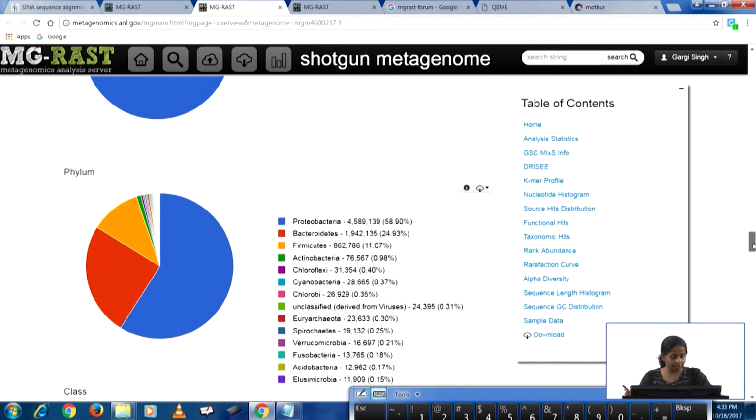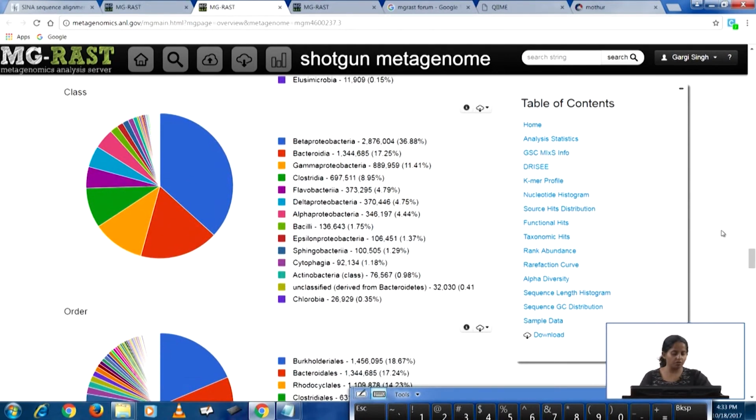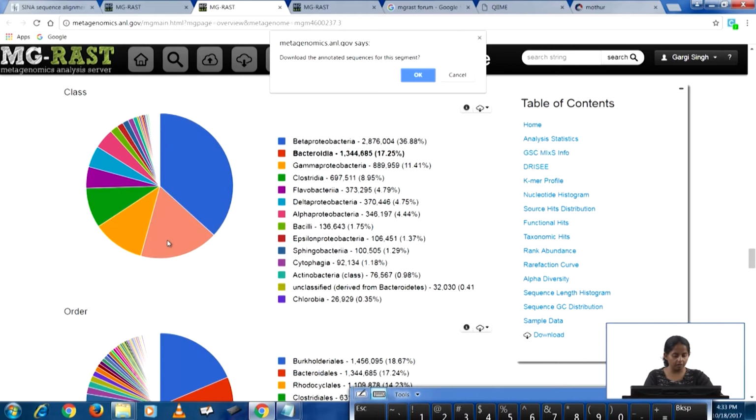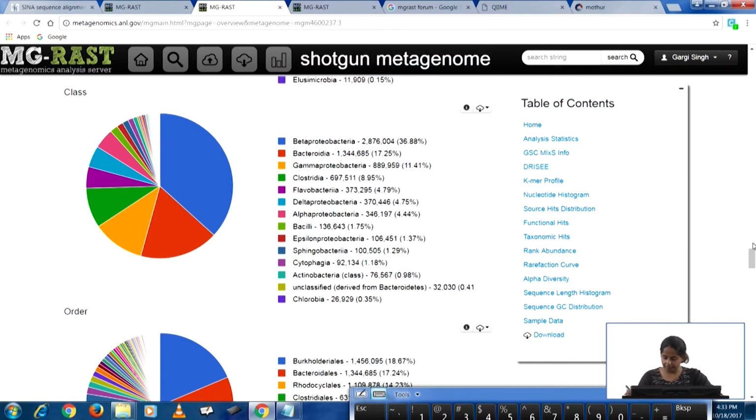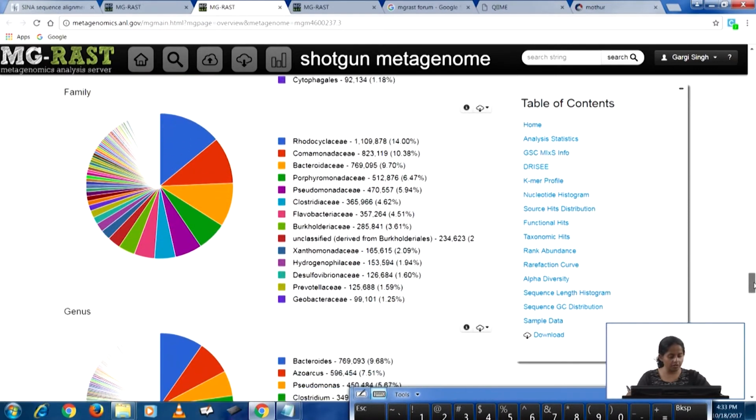So if I go to the phylum level, I see that most of them were proteobacteria, some were bacteroidetes, some were firmicutes. I was very interested in bacteroidetes and firmicutes, and then actinobacteria, chloroflexi, and so on and so forth. And then on the class level, most of them were beta proteobacteria, followed by bacteroidia, followed by gamma proteobacteria, followed by clostridia. I was very interested in clostridia and in bacteroidia. Then in the order level, again it divides into different parts. Again, Clostridiales was very important because this was a cellulose-degrading study. And then it will also tell me on the family level.